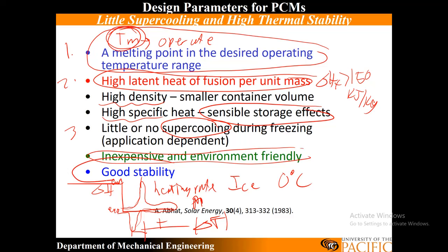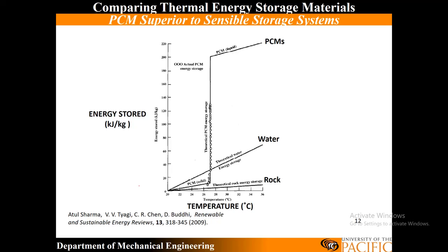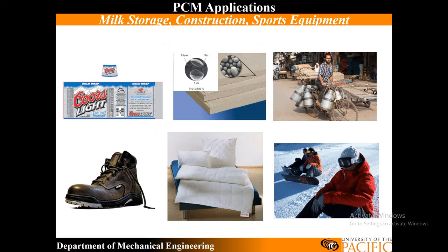And the last thing is we want good thermal stability. This is a very important parameter. Again, these are just relative rankings; it's really going to depend on your specific application that you identify in this lab. I want these plots to reproduce over and over, through millions of cycles, especially for regulating room temperature applications. But if you start to see shifts in peaks as I heat up, then that's an issue.